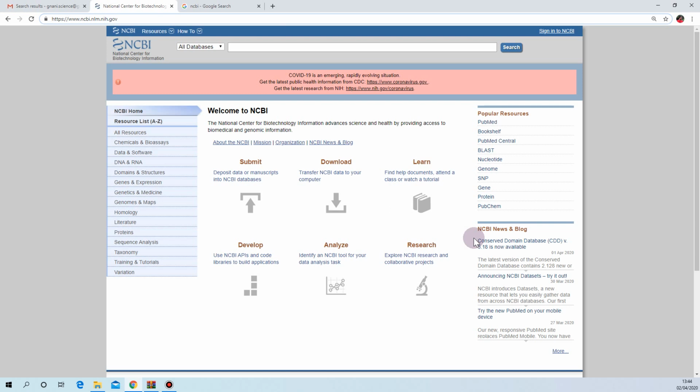database. This is called a primary database, where we have plenty of options, like submitting sequences to the database. So if you are going to sequence a new species, or identify a new bacterial strain based upon its 16S rRNA, and you say that yes, you got a new strain, those can be deposited in this NCBI database. Similarly, we can retrieve the strain, the gene information or genome information of specific bacteria from this large database.